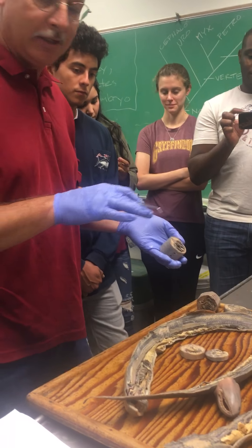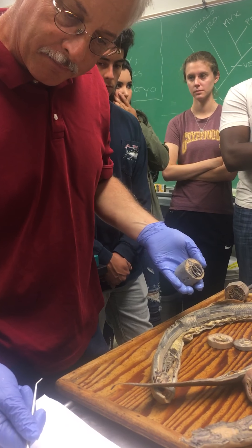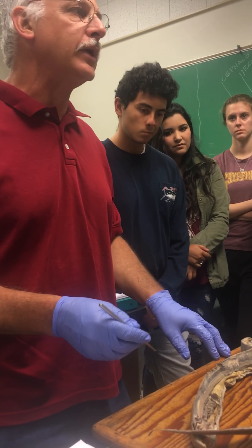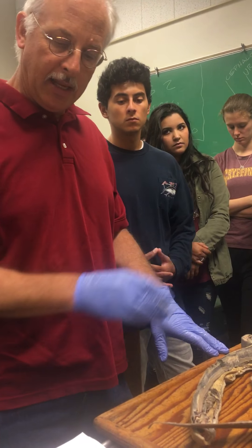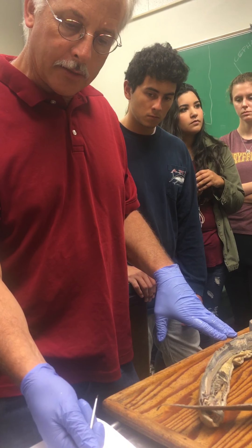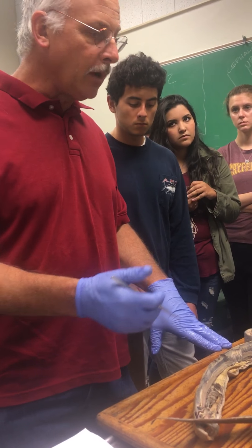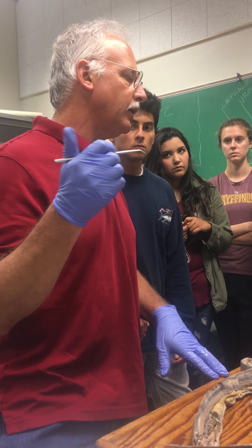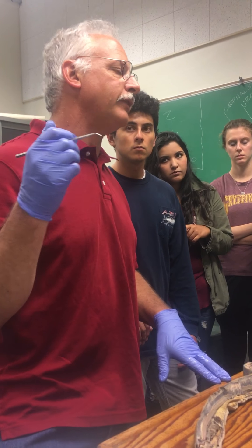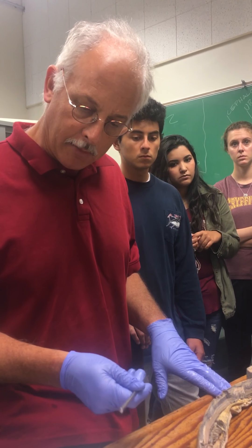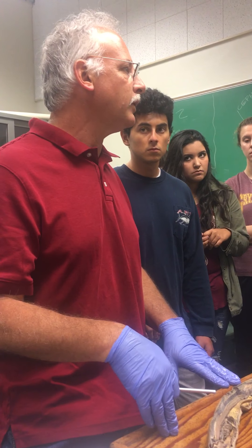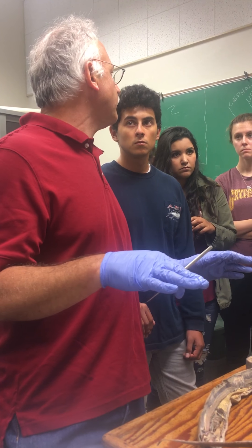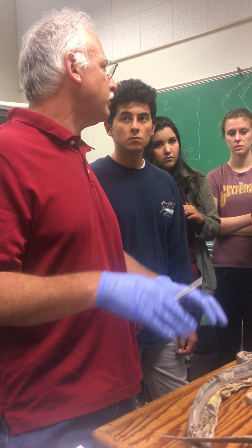Some of the other vessels — carotid arteries are just the front end of the dorsal aorta carrying blood to the head; the caudal artery and caudal vein are in the tail region, continuations of the dorsal aorta and the drainage into the common cardinals. We'll go over these vessels in much more detail with the shark. For the lamprey, focus on the heart and the dorsal and ventral aorta.